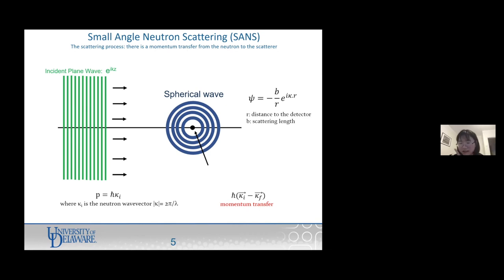And I remember you also said that we can get concentration. Mm-hmm. Concentration, you cannot directly get that. We expect that you know that about your sample. You can get molecular weight information if your data is well calibrated, and typically we do that by measuring a second sample, for which you already know the molecular weight with accuracy, and for which you've carefully measured the concentration. So we can calibrate our data to get a semi-accurate measurement of your molecular weight, which is interesting. For example, if you want to know if you have a dimer or a trimer, so what size of molecule you have in the solution. But SANS is not the technique to measure concentration, not really. You should use other techniques to get more accurate information about that.